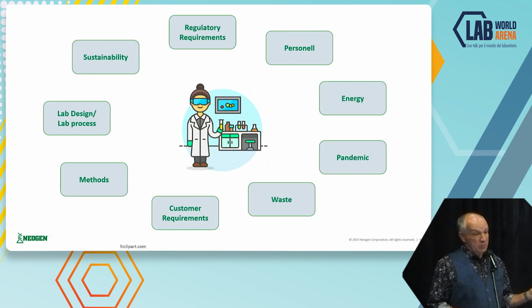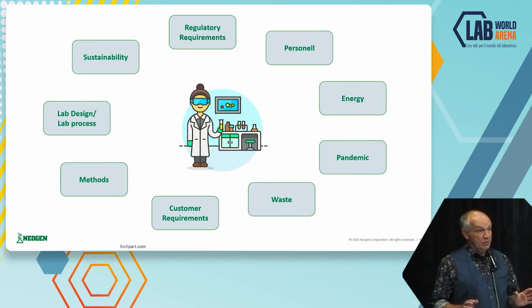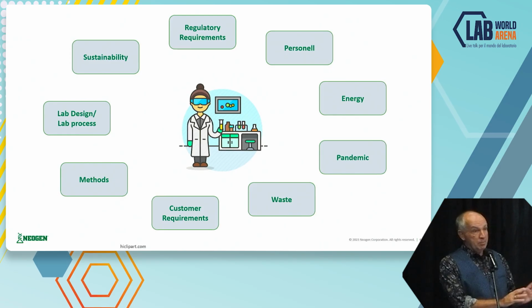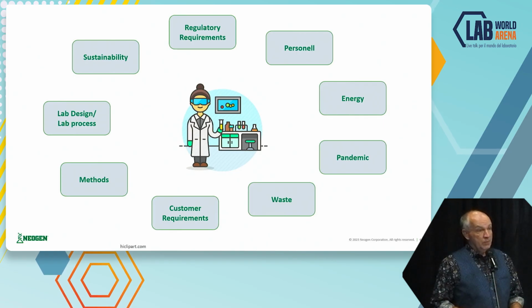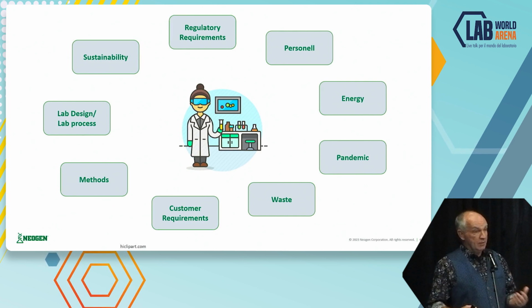So we only need to think about 2020 when the pandemic was. It was a big issue in the laboratories. They didn't want to have so many people in a small room. So some labs went for shift systems, they reduced staff. Some labs almost closed during that time. So there was a big need to think about how can we do our job with fewer people, or maybe in a different way, with reorganizing the lab, another workflow to keep people a little bit away from each other, to decrease the contamination issue.